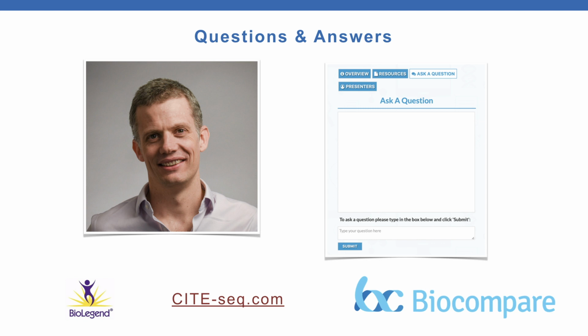So I think that they're trying to push people towards using those reagents. But we use TotalSeq-A, and it works fantastically well in our hands. There's no detrimental effect on the mRNA quality, so we think either can work just fine.